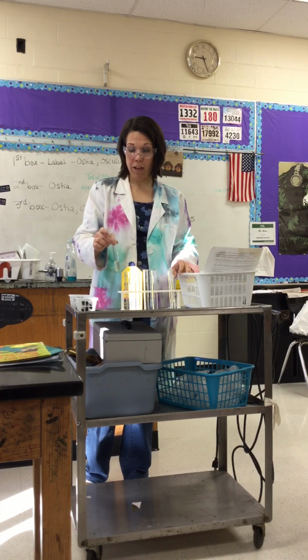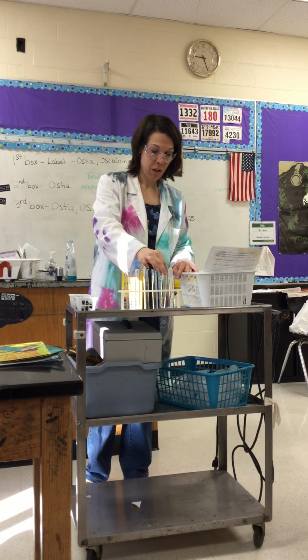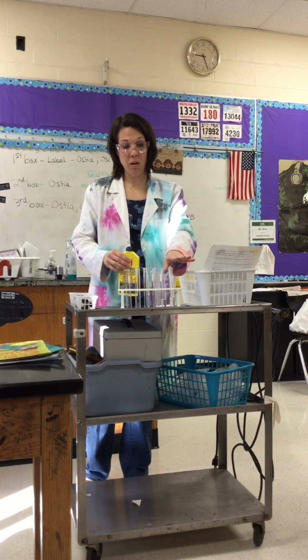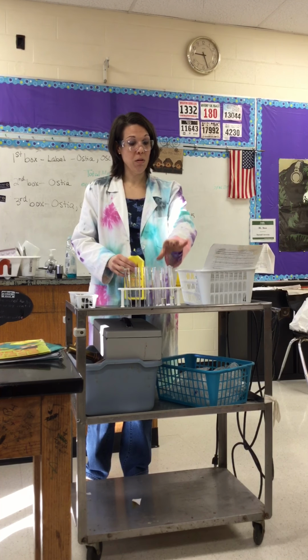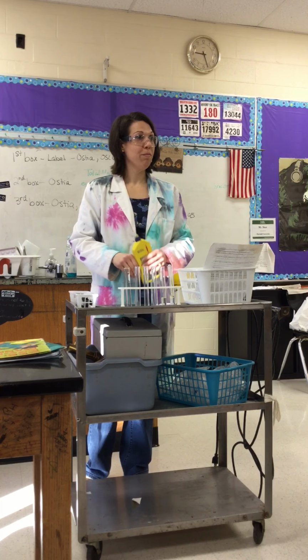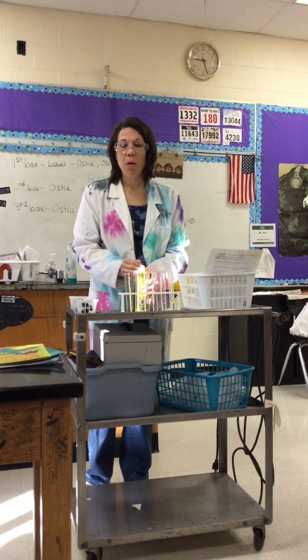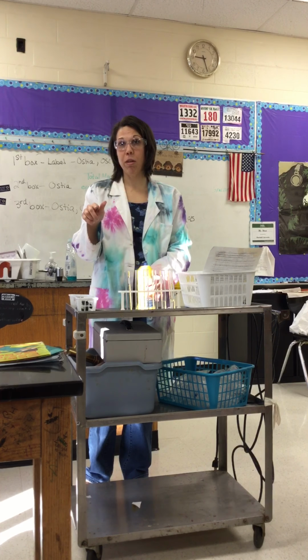So that's the second test that you could do. You could mix your substance with water and see if it dissolves in water. If you think it's nonpolar, try another nonpolar substance like lighter fluid and see if it dissolves. So when we do that part of the lab, you're going to take your substances back there and do the solubility test.